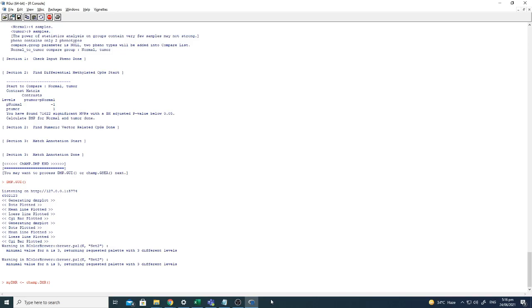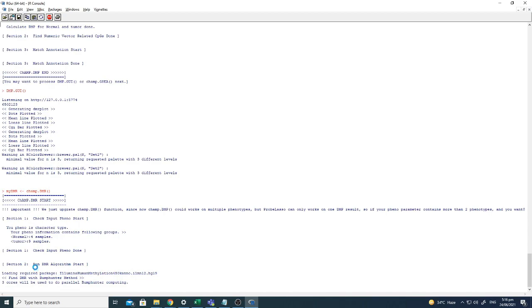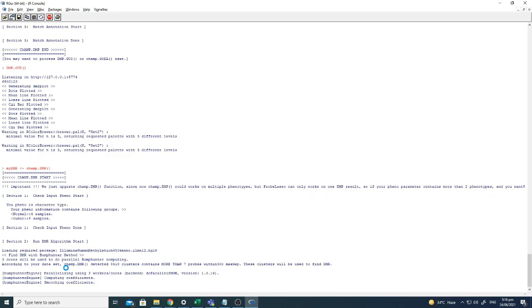You can also do this. I am just using the R console because you can easily understand each step of this R package. Otherwise, you can also open an R script file, paste all the commands and then run them collectively, so by the end of the commands you will get all the outputs. However, I recommend you first use the R console and check each command separately, that all the commands you are using during the analysis are working properly.